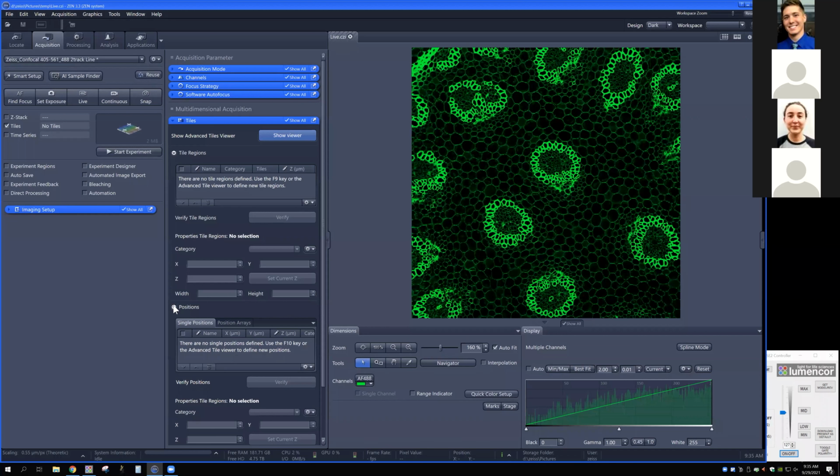And then I realize also that there are a lot of different groups here that are working and pushing towards and developing assays that involve multi-well plates.